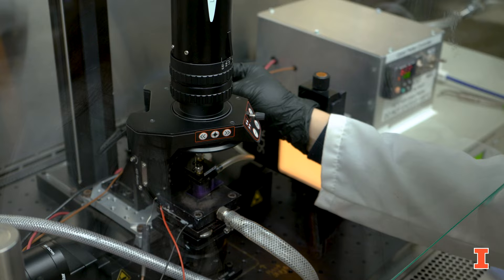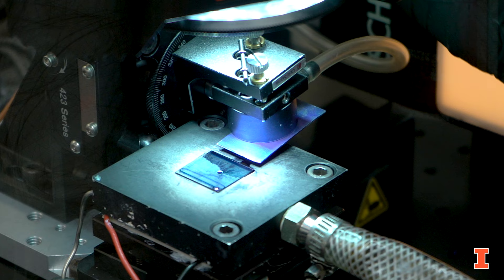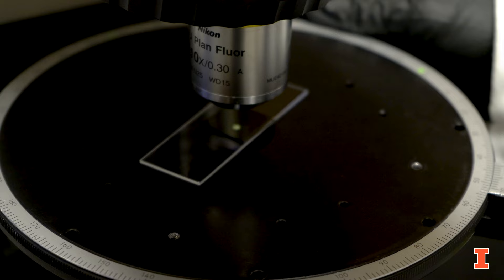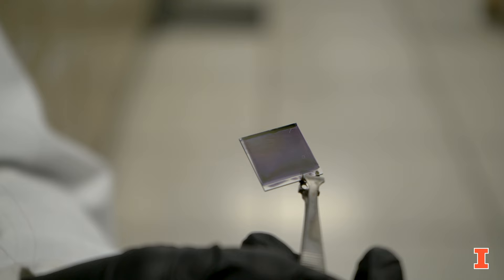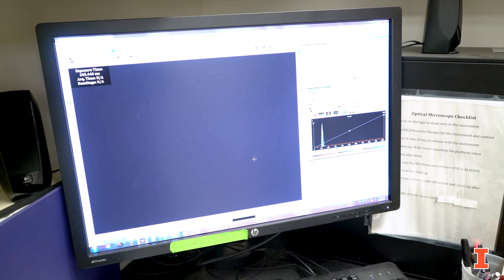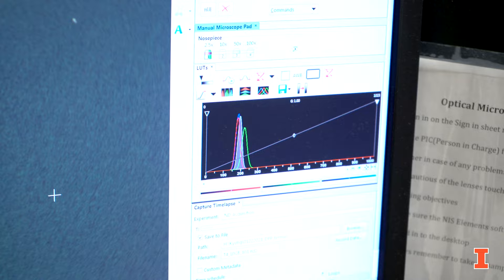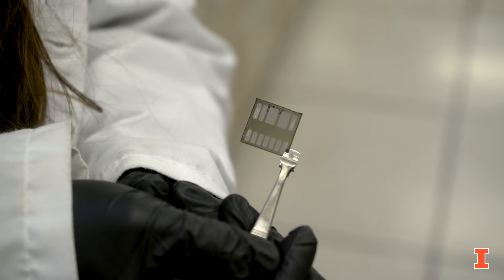As a substrate we're going to use glass with ITO, or indium tin oxide, coating. The first thing we need to do after cleaning the substrate is deposit the photoactive layer using a 2D printer. After we deposit our film we're going to do optical characterization using polarized microscopy that we have in the lab. After we do all the film characterization, we're going to deposit a silver electrode on our solar cell — we can either deposit it using physical vapor deposition methods or we can use our 3D printer developed in our lab.